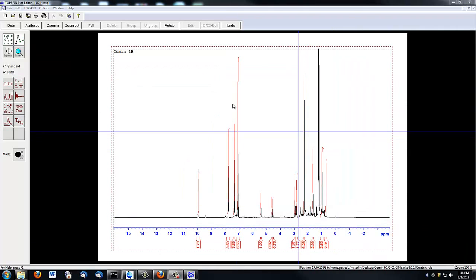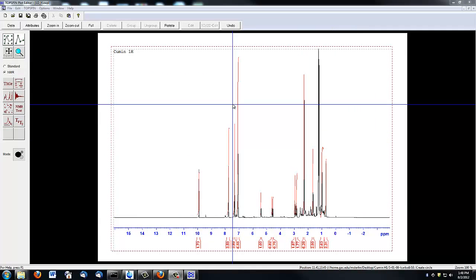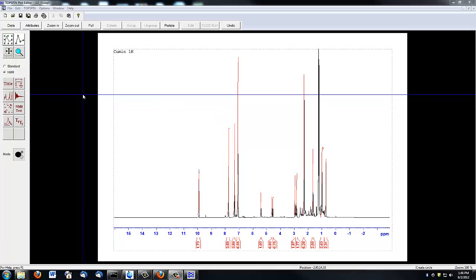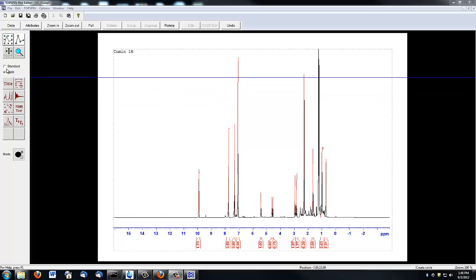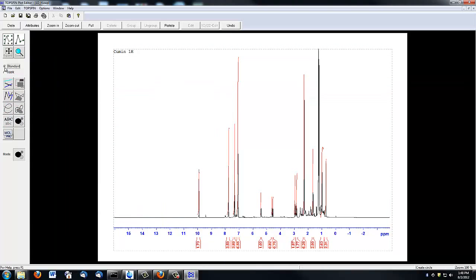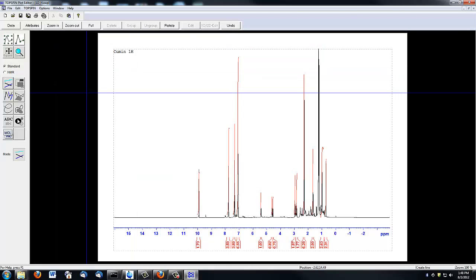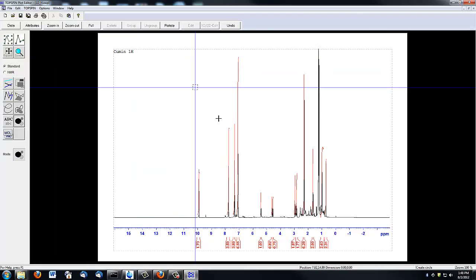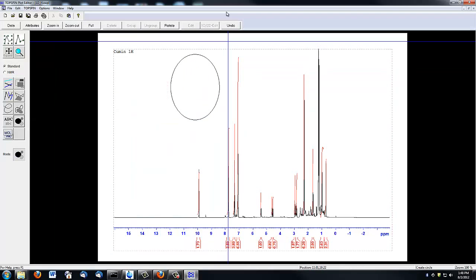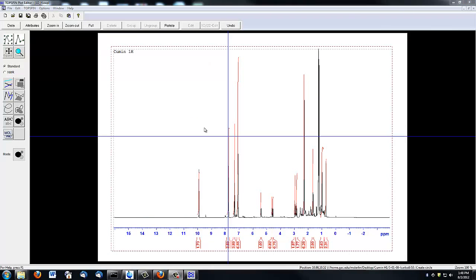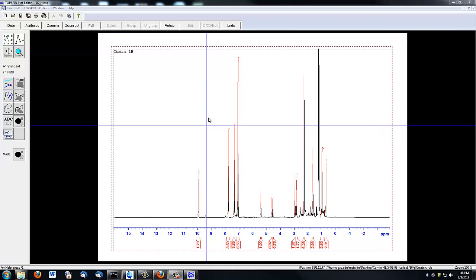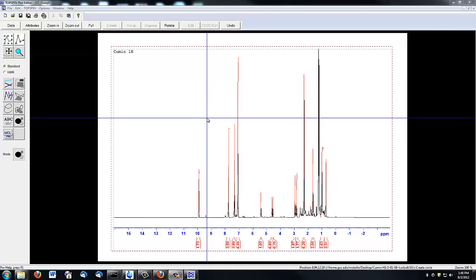You can also add shapes and graphics to your spectrum. To do this, click the Standard button, and from here you can add lines or shapes anywhere you wish. Once you think your spectrum is ready to print, simply click the Print button.